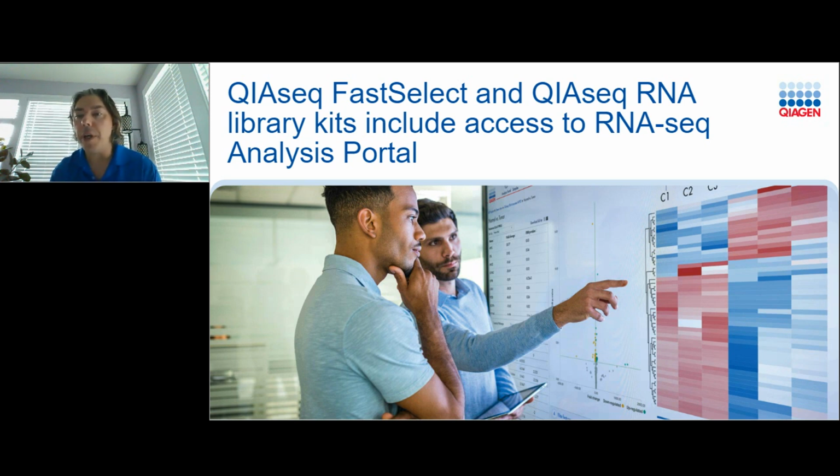And for a lot of the bioinformatics that are out there, when you turn your FASTQ file over to a bioinformatics scientist, they don't really want to map ribosomal RNA. That often ends up in the reads that don't map, and you don't really know what's going on there. So this is really a quick and efficient way to see what ribosomal RNA is there, how much you're removing, and then it also is a full-blown RNA-Seq analysis pipeline if you don't have access to one.